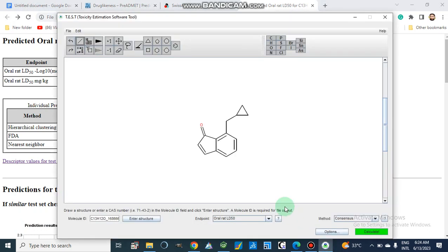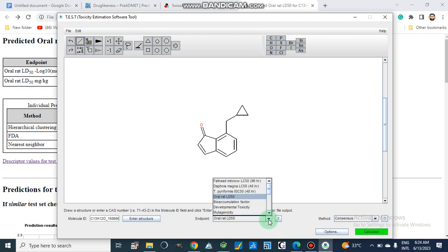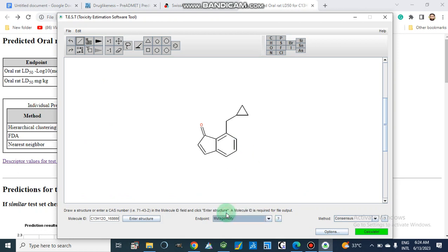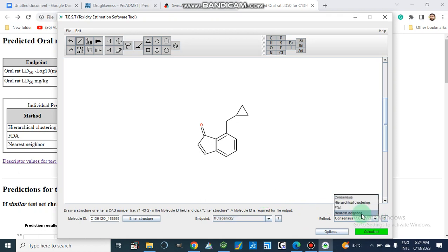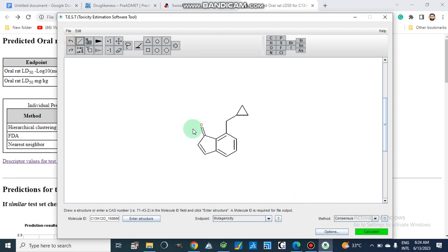After saving this file, we want to check other toxicity parameters for this compound — specifically mutagenicity. If we don't get LD50 from the consensus method, we can choose from the nearest neighbor method or FDA. Now we are going to calculate mutagenicity.